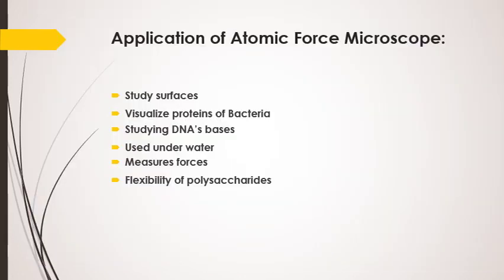So here we have some of the applications of the atomic force microscope. First of all, studying surfaces. The atomic force microscope can be used to study surfaces that do not conduct electricity well.